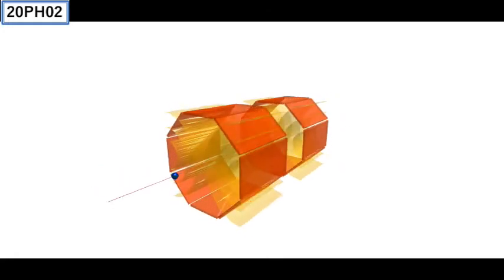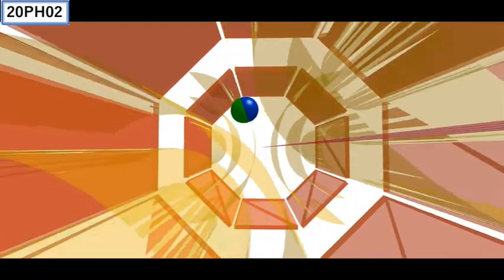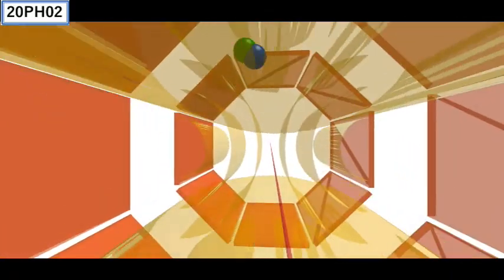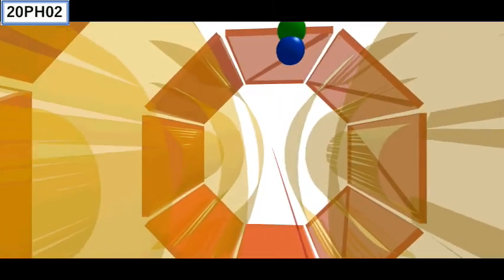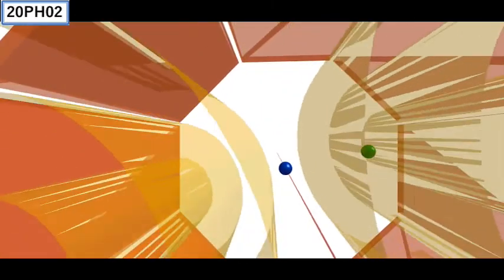This graphically shows the principle of two rotating field mass filtering. In the first rotating field, mass filtering slightly occurs on this trajectory. But in the second field, the phases are opposite and the mass separation is accelerating to this axis. Yes, this axis.